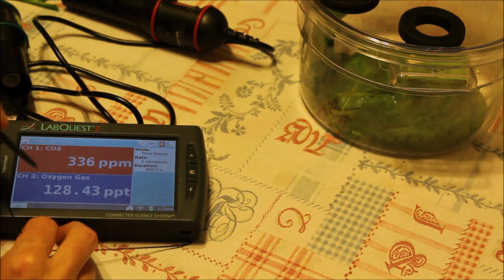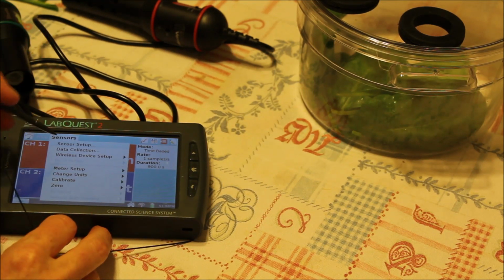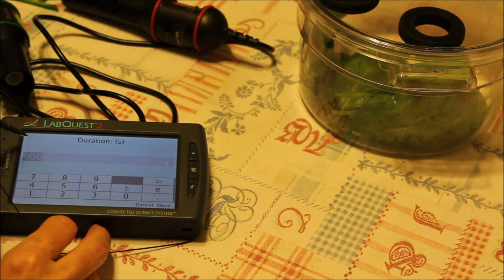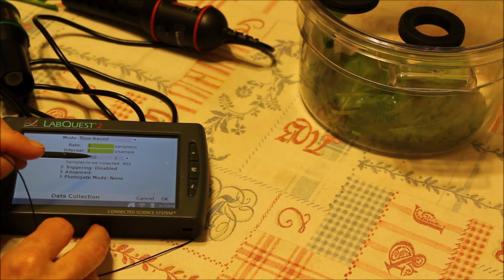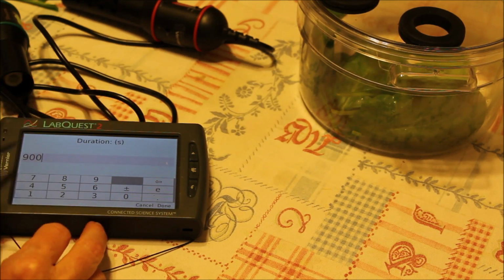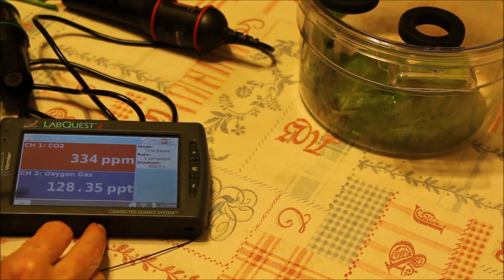In order to measure, you will go to sensor and data collection. The default duration on your machine is 300. Please change it to 900. So you click on it and you put 900. It will be the duration in seconds, and you will press OK.